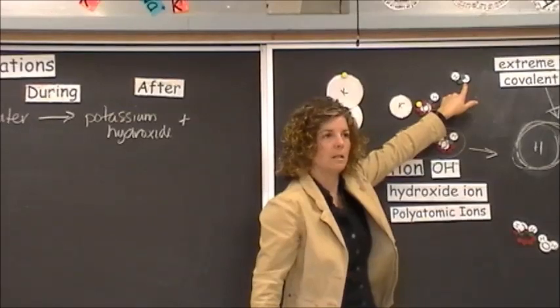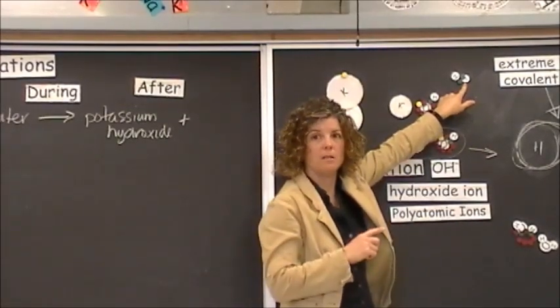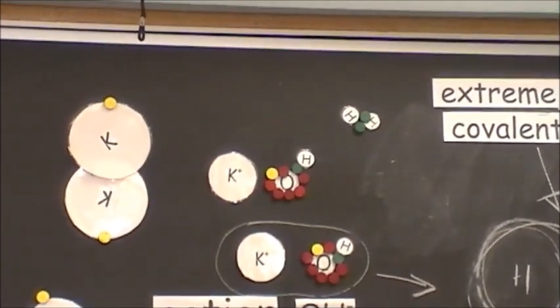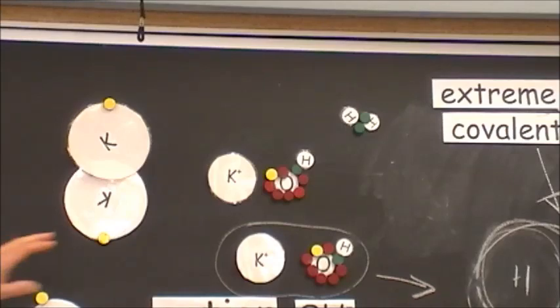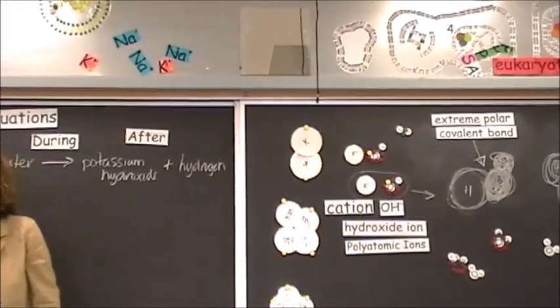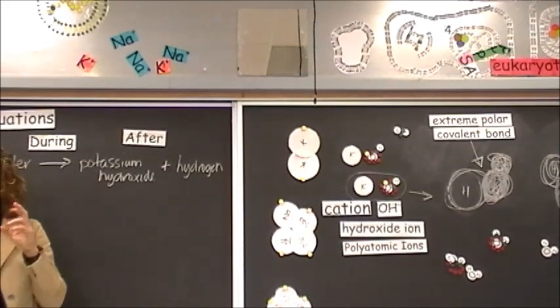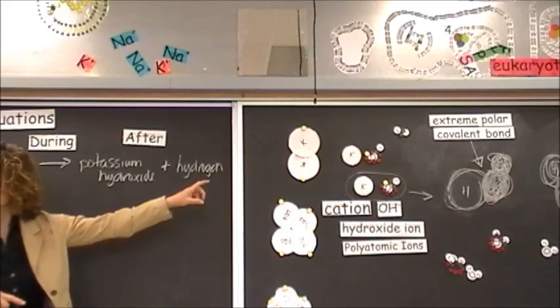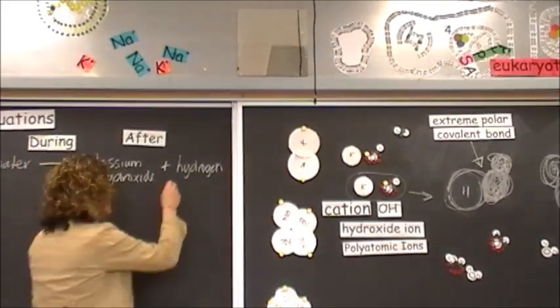What about this guy? Because that was also made. Can you see that okay? Good. What's that thing called? I already described it. Come on, guys. Celine, what's that thing called? The hydrogen ion? Nope. You got hydrogen. What state is it in after? Bubbly, bubbly. What did I describe that as? Bubbles of gas. This is a gas, right? So we actually say hydrogen gas.